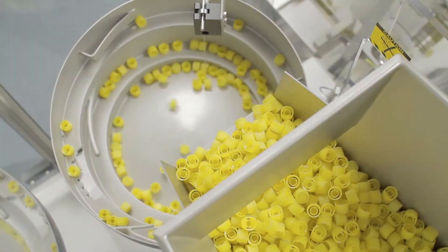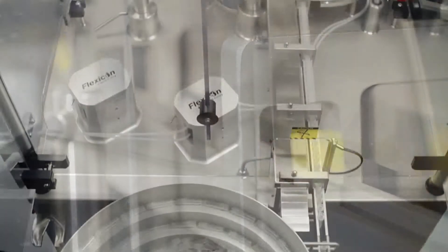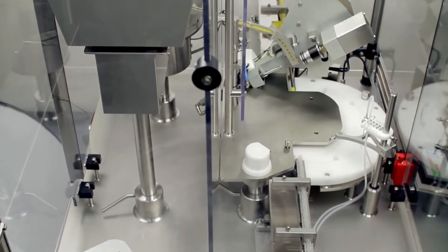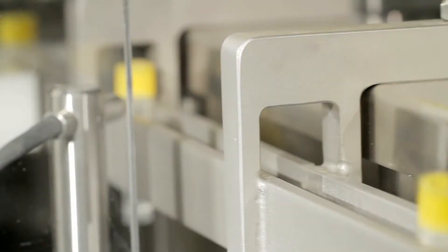Production costs are minimized with a single operator able to fully manage up to 2,200 units per hour. A production run could be set up in under 20 minutes, making the achievable total capacity per working day unique for this size of filling and capping solution. The FMB210 is perfect for small to medium sized batch runs.